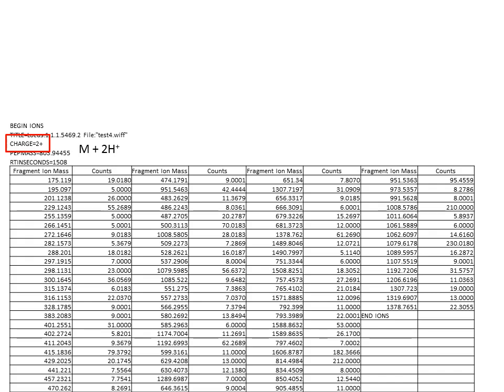The software will then take the theoretical peptide mass list and make a sublist containing the theoretical peptides with a mass of 1605.8 Daltons plus or minus an error tolerance, in this case about 0.02 of a Dalton. This sublist may still contain hundreds to thousands of theoretical peptides, all with different sequences, that will all have a mass of about 1605.8, give or take 0.02 of a Dalton.